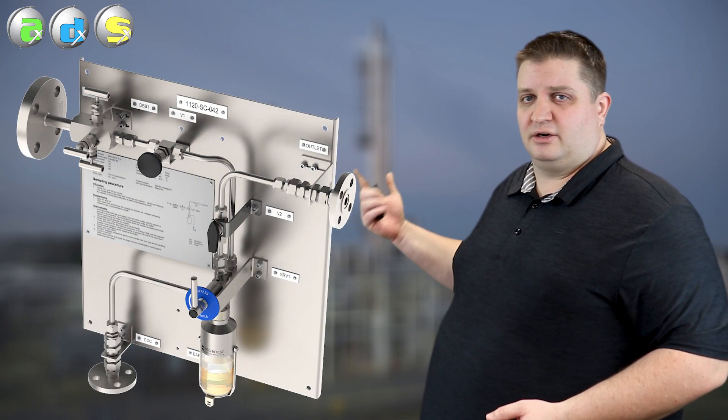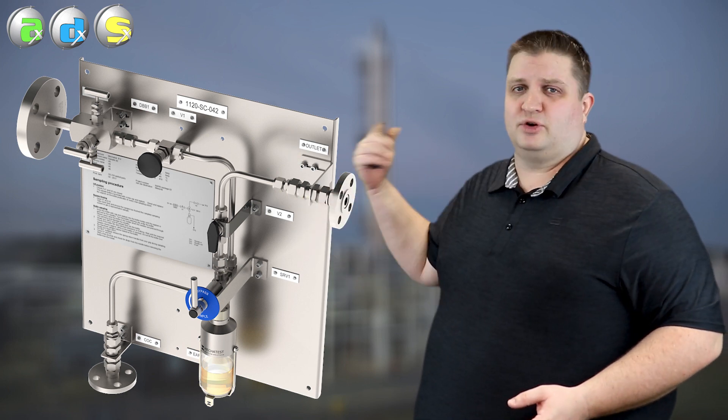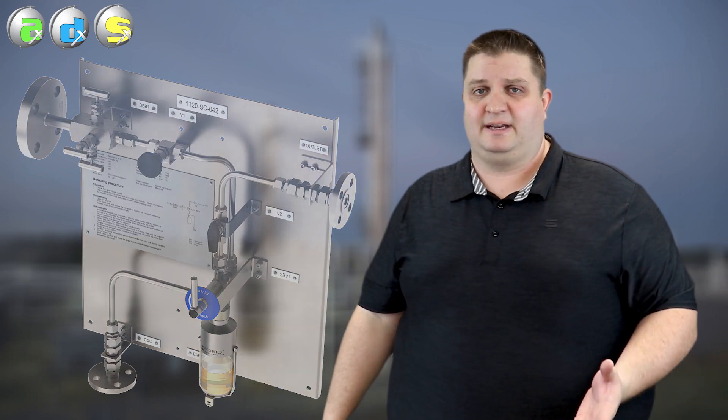To do this ideally we want one of these here, a sample station. These are great because they've already got that purge line built in where they're going to be constantly flowing and you're going to be able to pull that nice sample of good clean amine. What you don't want is to pull a bunch of black amine that's going to settle out to the bottom or it's got a bunch of junk that's going to float to the top just because of where you took the sample point.